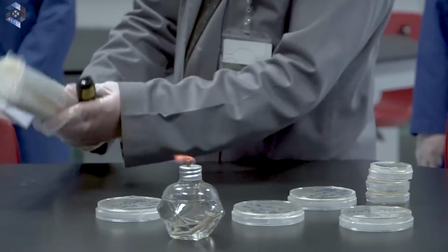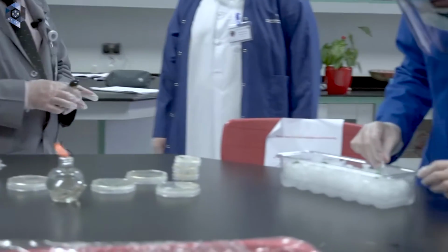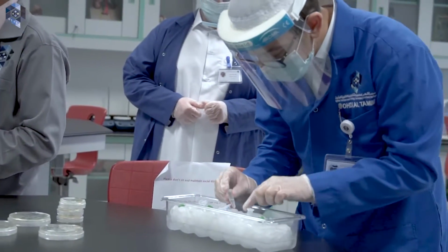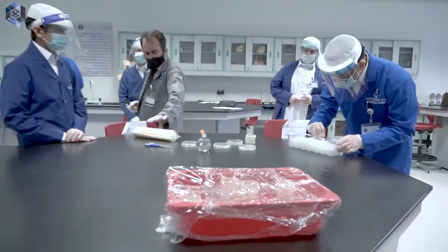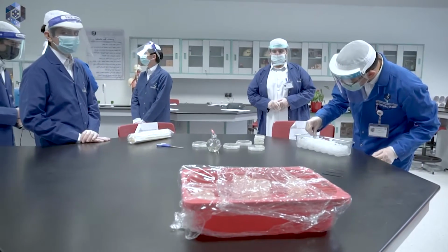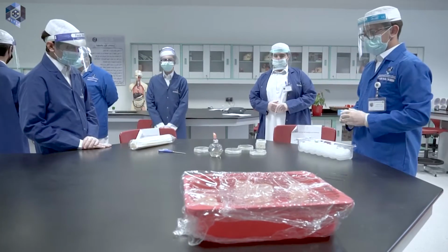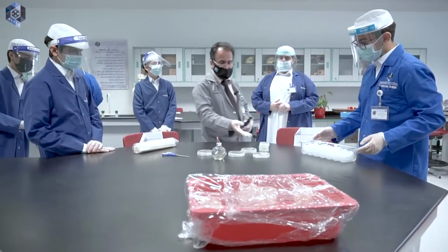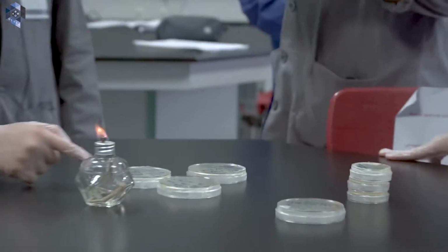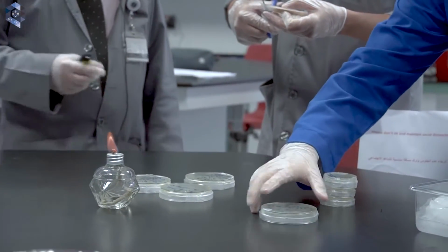Now, there were toothpicks. Sterile toothpicks. We will use the toothpicks. Which of these source plates are you going to use? Decide. Which one do you like more? Any of them. Okay, no problem.